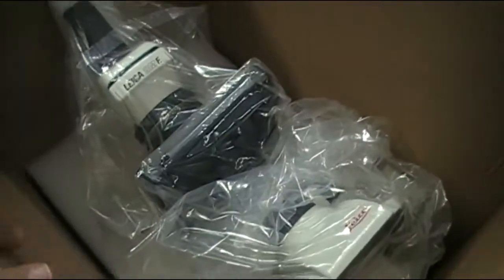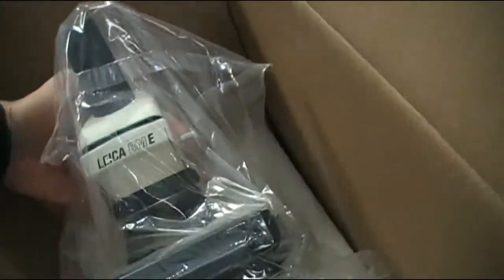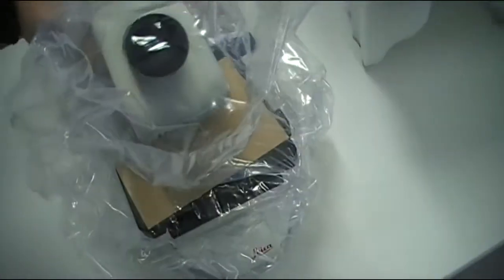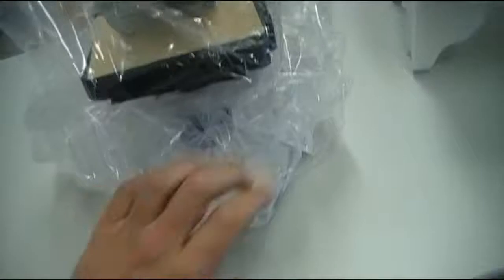Power cable over here. Now, the microscope — how do I take it out? It's a little bit difficult holding the camera and the microscope at the same time. Okay, I'll hold it over here and move it over here. Now I remove the plastic — there's some silica gel to keep it dry.